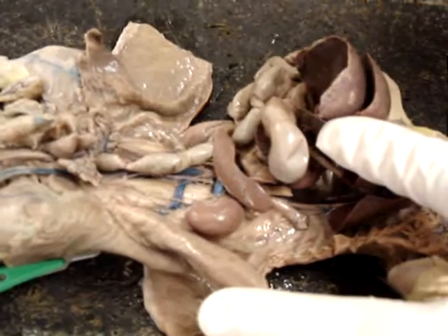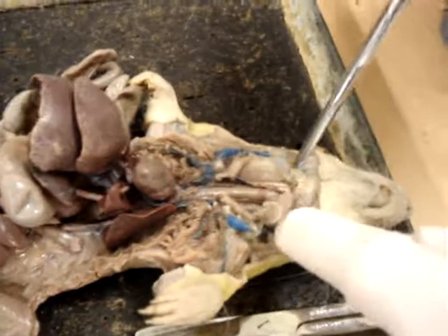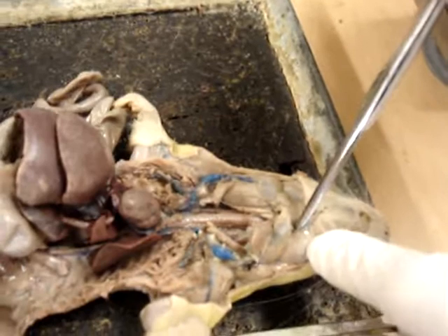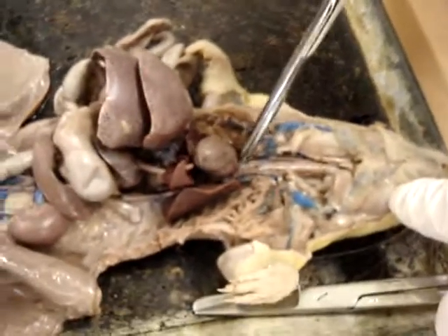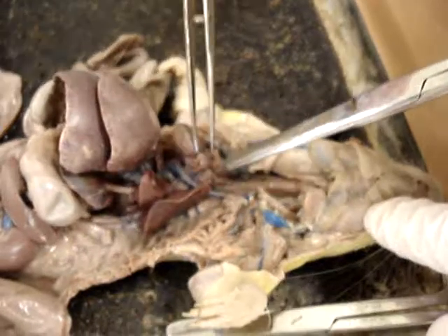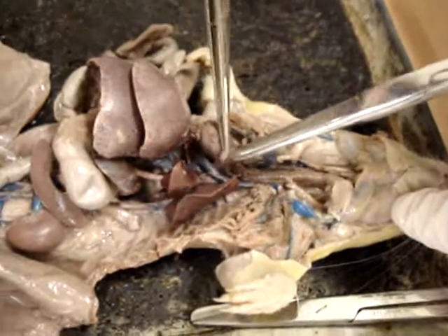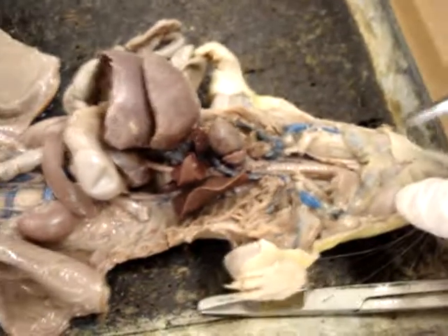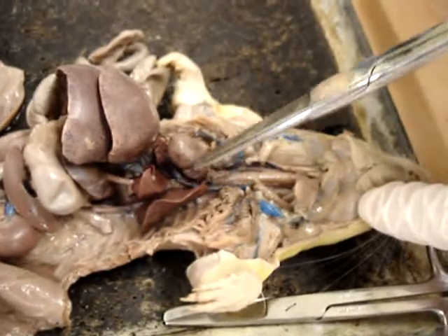Now the endocrine system. The thyroid — you can't really see it here. The thymus is right above the heart; it's a gland right above the heart. That's the thymus — very important, one of the key endocrine glands. The thymus is where T cells are produced. The pancreas, which we've already gone through, is right there.